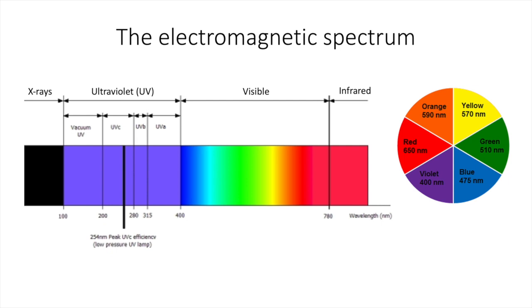On the right, you see what's called a color wheel. So remember that when we see color, what we're seeing is the light that is not absorbed by the compound. So if I shine, for instance, a white light on something and it looks green, that's because it's absorbing red light. So if we look across the color wheel, that shows us the correlation between the color absorbed and the color seen.